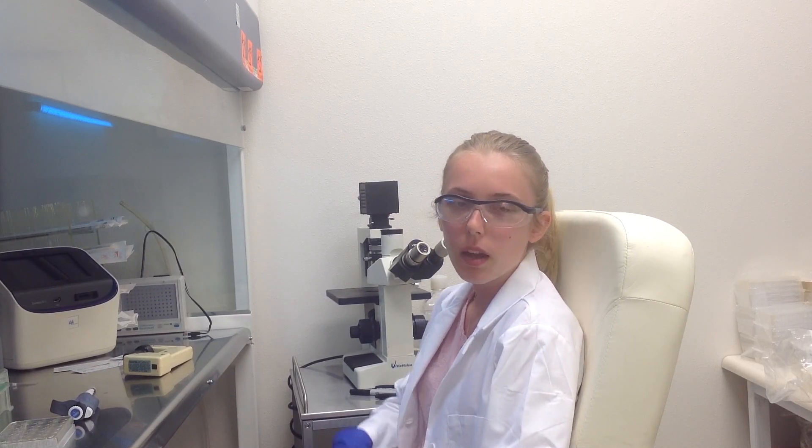Today we will be transfecting PC3 cells that came from ATCC. We will be using a transfection kit manufactured by Altogen Biosystems.